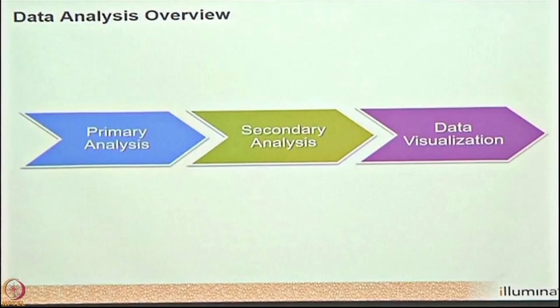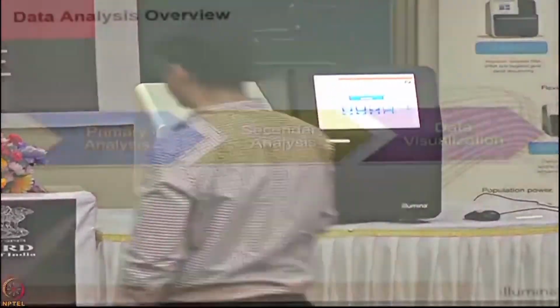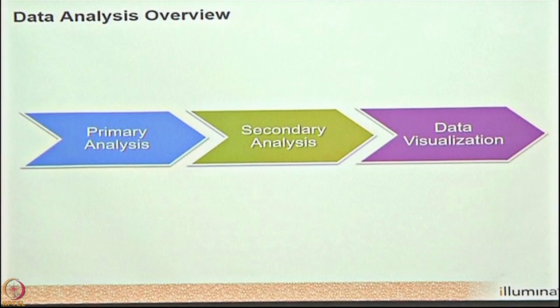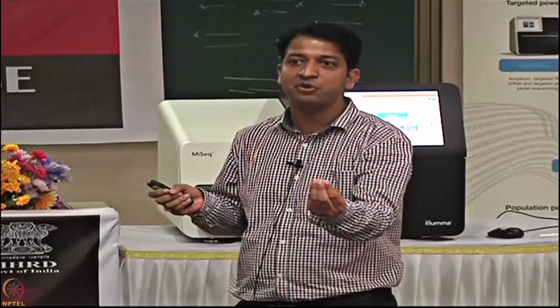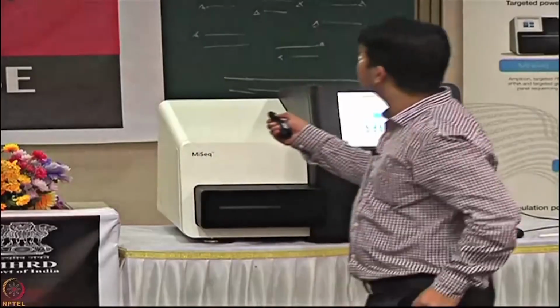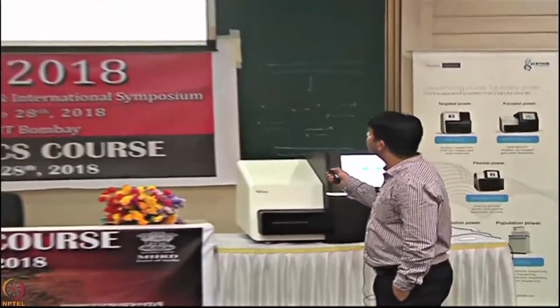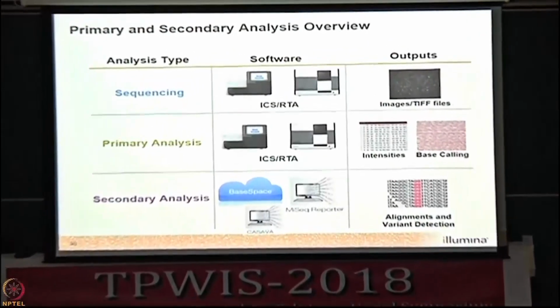So once we are done with the sequencing, the final stage is the data analysis. There are 3 kinds of analysis. First one is the primary analysis. During primary analysis, all the bases are tagged with a fluorophore, right? Initially, the camera will record the signals like this. It will be colored though, so red, green, yellow, but these are all your bases called.